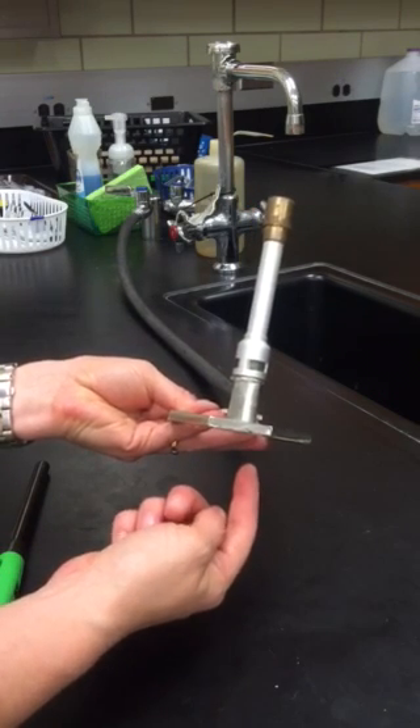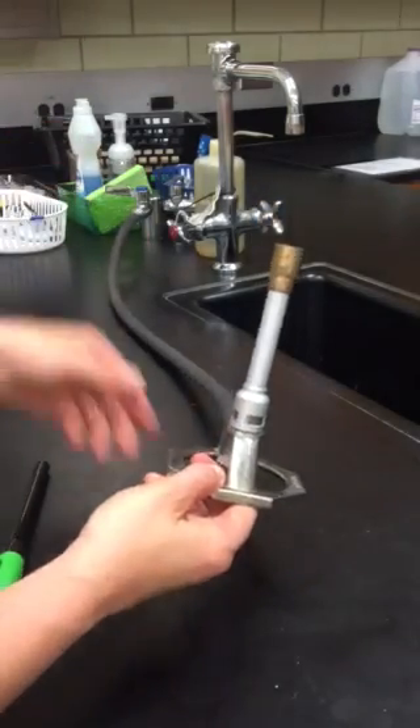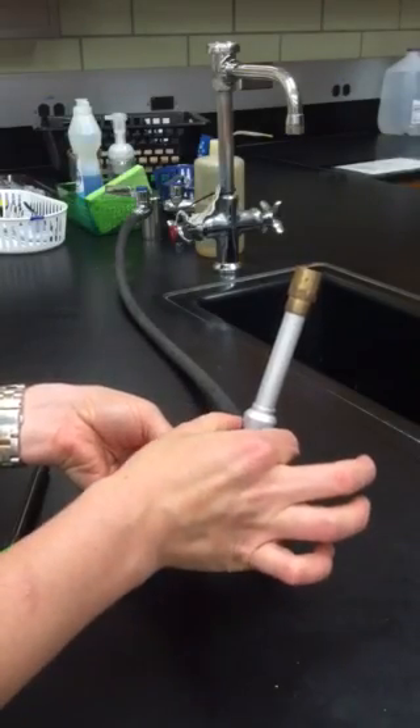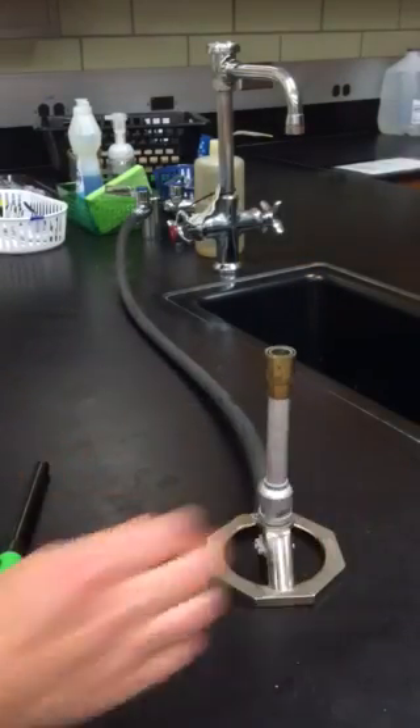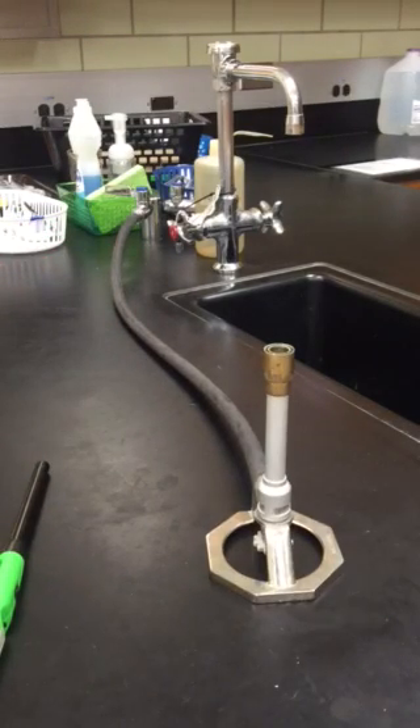Right now there will be no gas getting into the burner. I also have the gas turned off at the jet, so no gas can get into the burner and no additional oxygen can get in through these air intake openings. I have my line stretched out nice and straight, and what I'm going to do is turn the gas on at the jet.